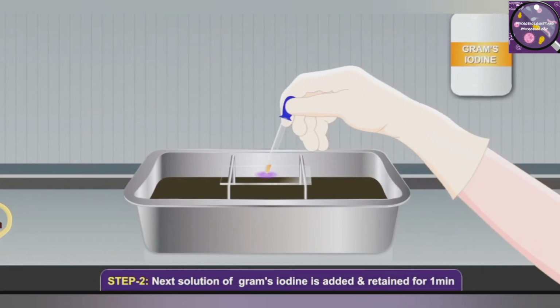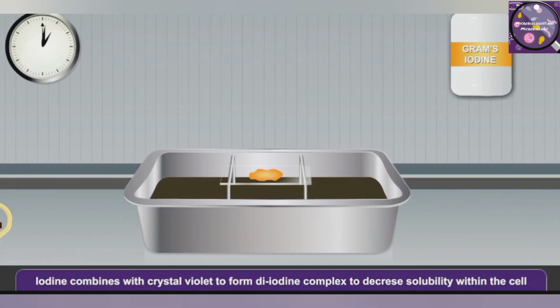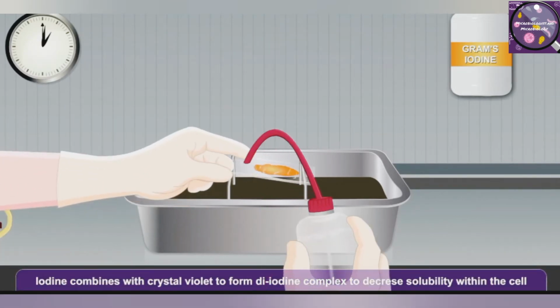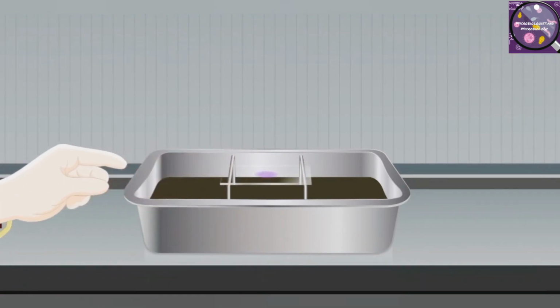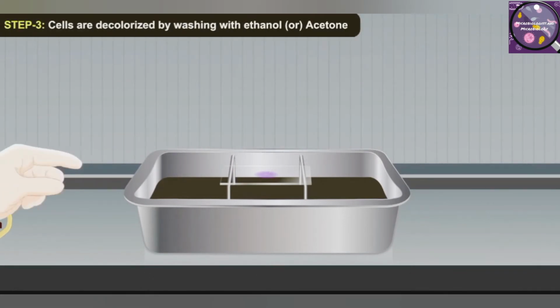Next, a solution of Gram's iodine is added and retained on the slide for about 1 minute. The iodine combines with crystal violet to form a crystal violet-iodine complex that decreases solubility within the cell. At this point, the cells still appear purple.